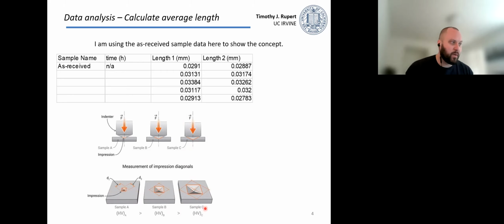But the main thing I wanted to point out in this case is that for each indent, we took 2 measurements. So we measured the diagonals along each direction, but really what we want is to be able to say what's the size of each individual indent.